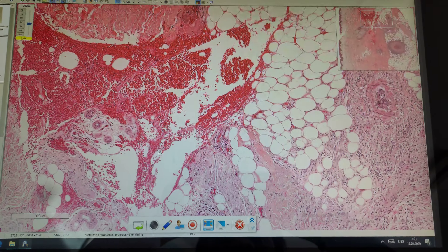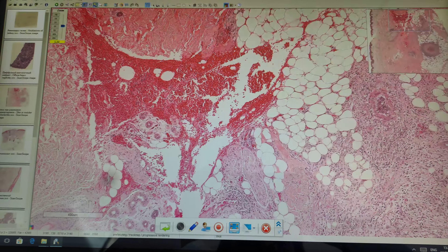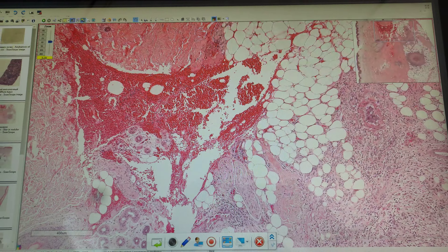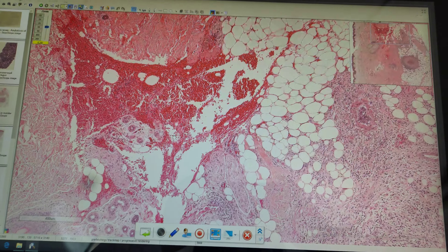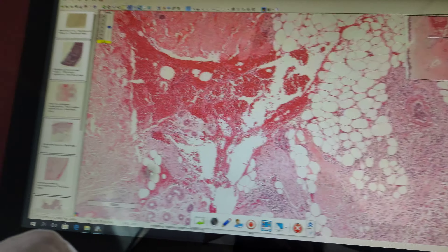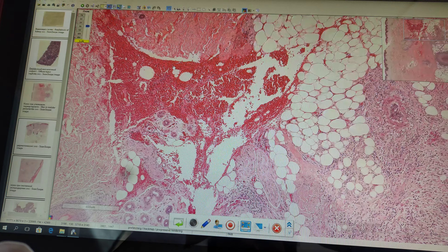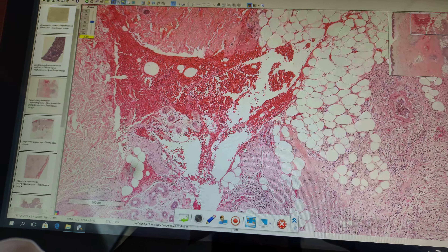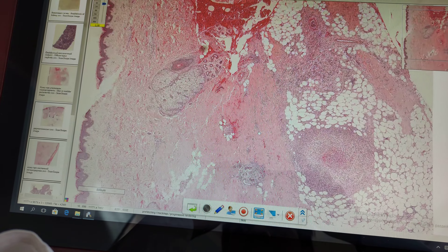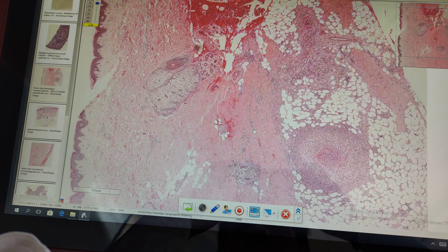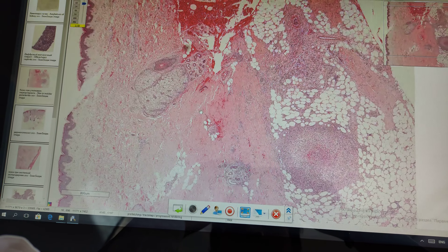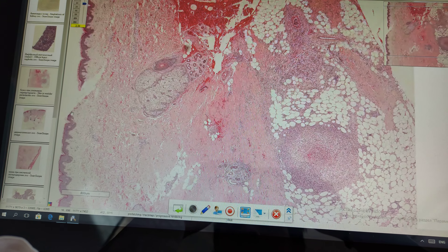As for the consequences: there are petechial hemorrhages in the dermis due to inflammation of the vascular wall. The outcome includes petechial hemorrhage and multiple hemorrhagic syndrome. This slide of nodular peri-arteritis is stained with hematoxylin and eosin. Thank you.